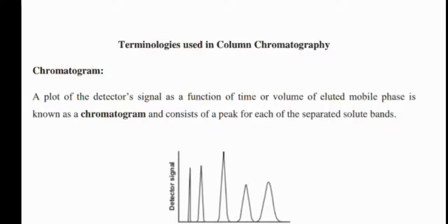So let's start our new topic, new video, which is the terminologies used in column chromatography. If you have already watched my previous video, it is on the topic of column chromatography, which is a type of chromatography. So our new video is on the terminologies which are used in column chromatography.